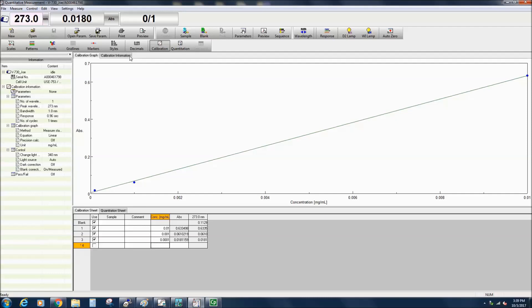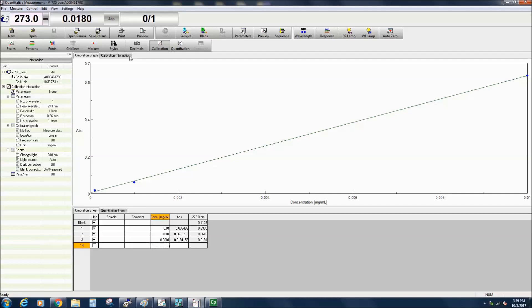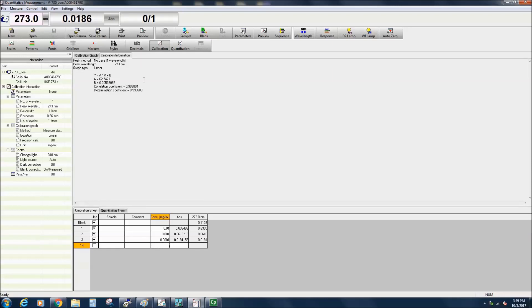To view the calibration curve equation, select the calibration information tab at the top of the graph. Here the peak method and equation are displayed, along with the equation coefficients and the correlation and determination coefficients. The calibration curve can also be saved by selecting File Save Parameters Calibration.